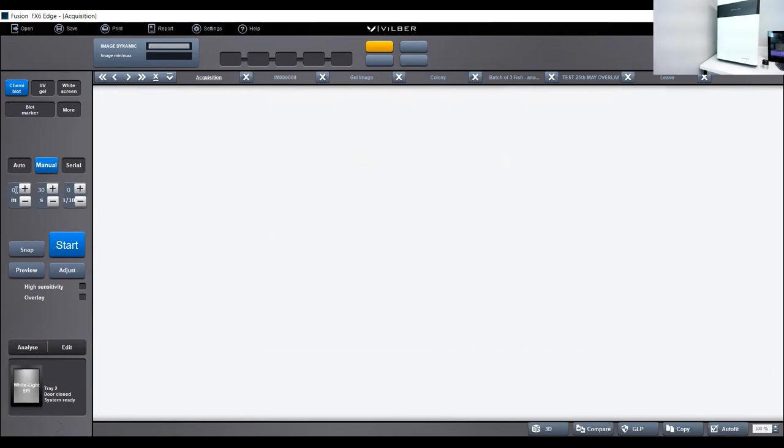Here you can select the number of minutes or seconds. You can adjust everything. So you can image up to 2 hours if you want to. And the serial mode allows you to do sequence imaging with accumulation or incrementation or repetitive accumulation images. So it's up to you to use the acquisition mode that best suits your needs.